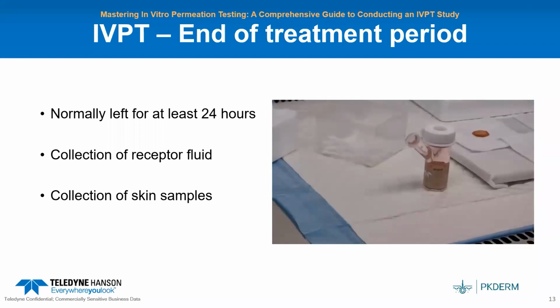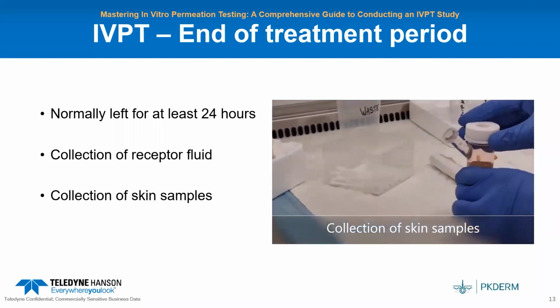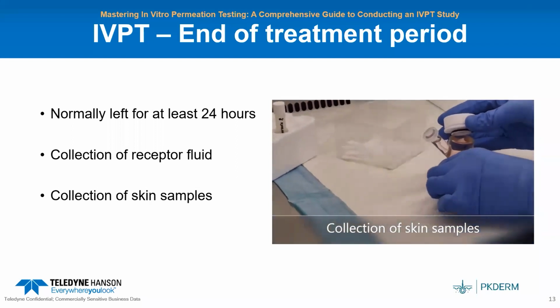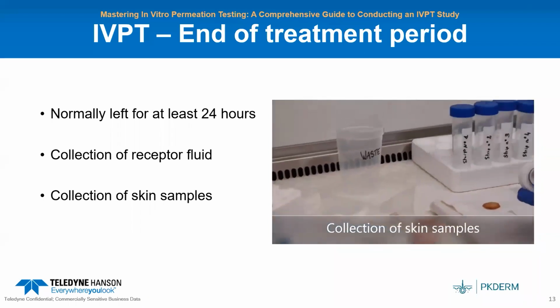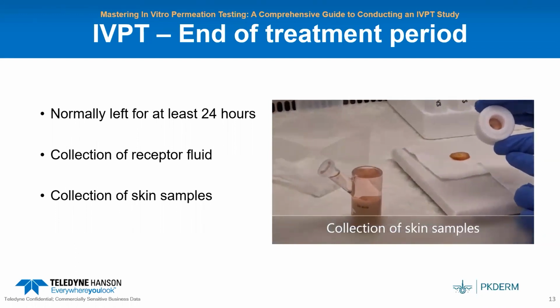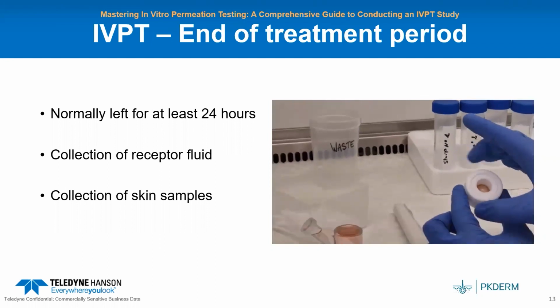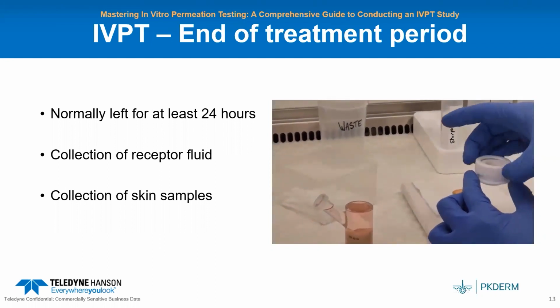And here you can see how we collect the skin sample from the Teledyne Hanson diffusion cell. So you can see clearly the treated area of the skin, where we can see the applied formulation on the top of the skin surface.